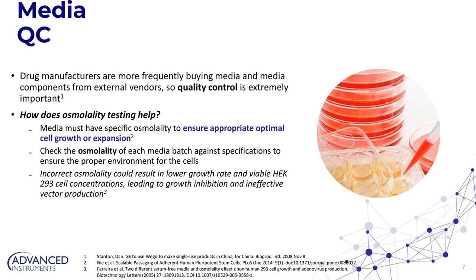For media QC, we do know there's a clear trend, within the mAb space as well as within gene and cell therapy. We're seeing an uptick in the number of companies producing drugs that are purchasing off-the-shelf media. They're outsourcing it and getting it from external vendors. As a result, we really see that quality control around the media, whether it's outsourced or made in-house, is becoming perhaps even more important than ever.